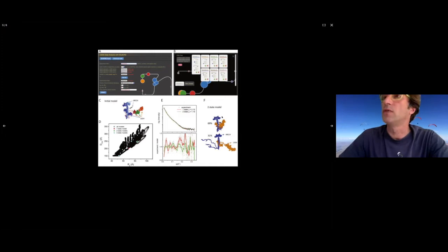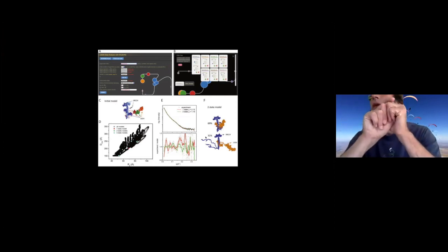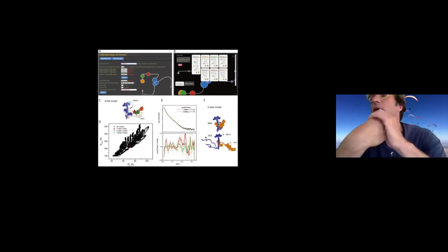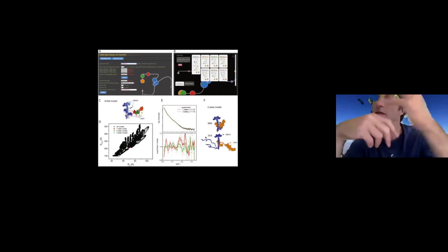allows you to select a multi-state, in this case this complex of XRCC4 and ligase 4, to fit the data properly. As you can see here, it was required to fit with a compact structure, but also with an extended structure. This is a very simple conclusion, but it shows that indeed we have a solution state that requires a flexibility of the ligase, moving around the scaffold protein, the XRCC4 protein.